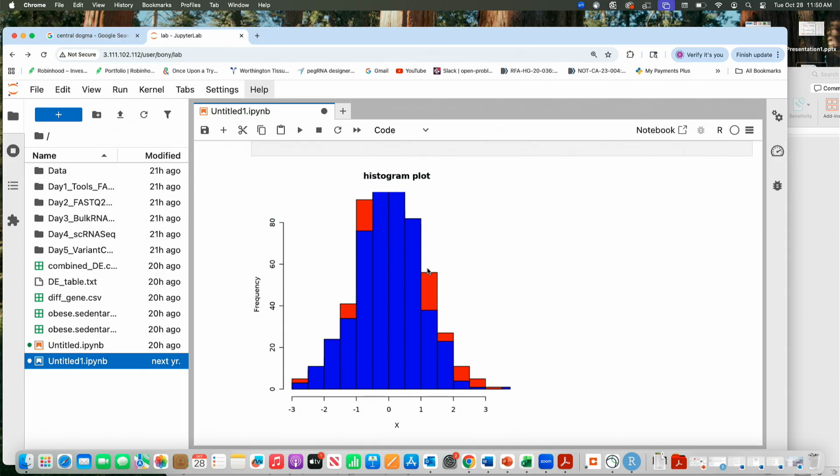But what is the problem with this histogram? We can't see it. Okay, so what will we do? There is no reason why you are not seeing it, and it is not because of a color. How many of you have actually worked with Photoshop or Illustrator? So layers are there. Basically you are putting two layers, but why are we not seeing both?